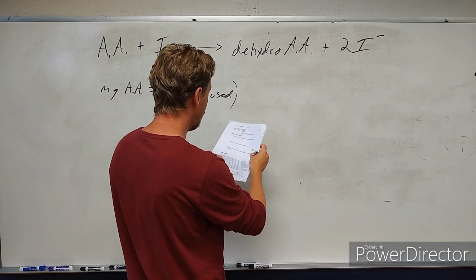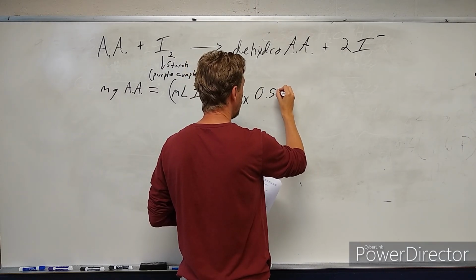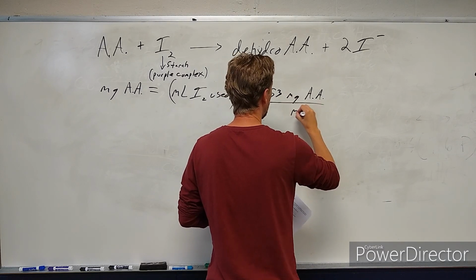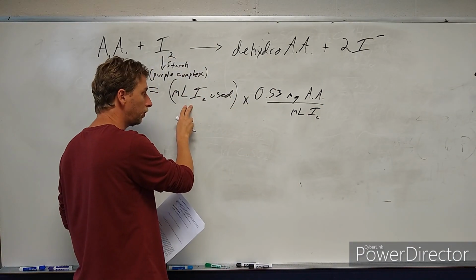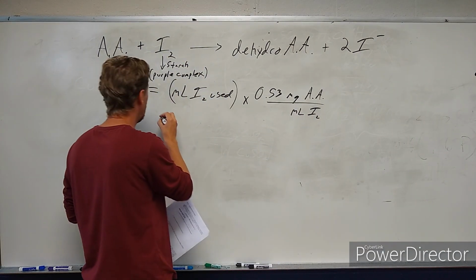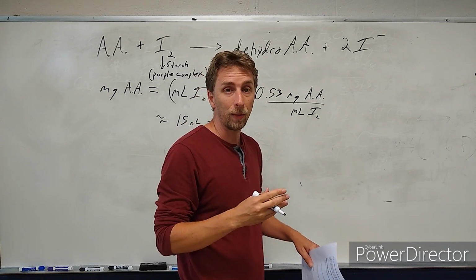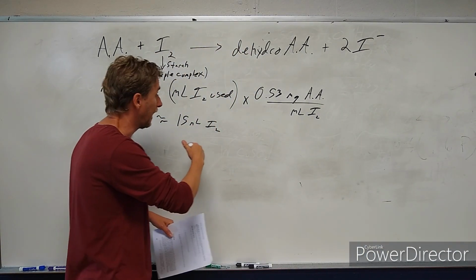And so it's broken down to a very simple multiplication. You say times 0.53, that's milligrams of ascorbic acid per milliliter of iodine. So how many milliliters did we use? Let's just make up a number and say, what if it was 15? Okay, so I'll put it like this. Let's say it was 15 milliliters of iodine that we used to reach the end point. For the setup, we saw that it's going to be between 20 and 30 milliliters of iodine, right? Well, let's just say it came out to be 15, lower than that, just for example.